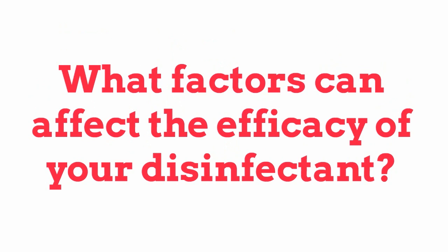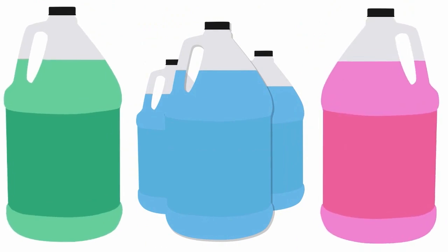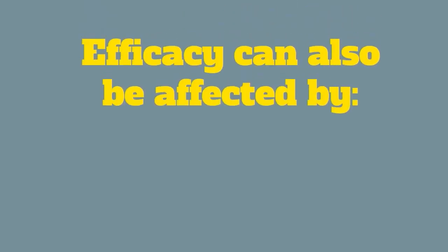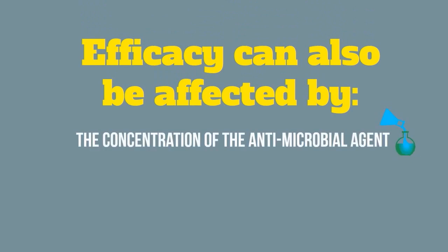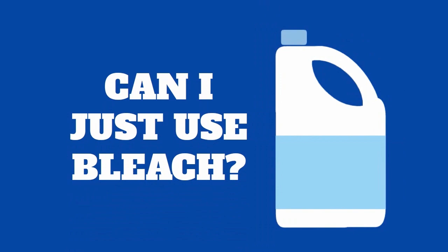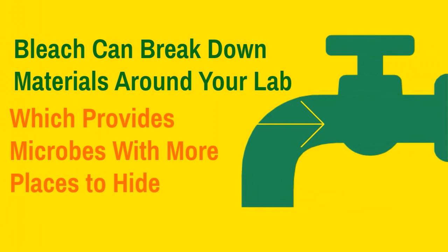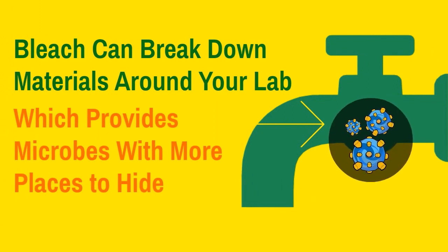What factors can affect the efficacy of your disinfectants? Besides the fact that different types of disinfectants and sterilants can kill different microorganisms, efficacy can also be affected by the concentration of the antimicrobial agent, composition of the microbial population, and the contact time. Probably the most common question we get is whether labs can just use bleach. While bleach has proven efficacy against a number of pathogens, it can also break down materials around the lab, which provides those same microorganisms more places to hide.